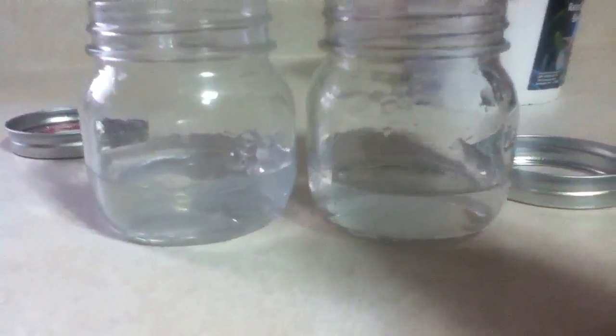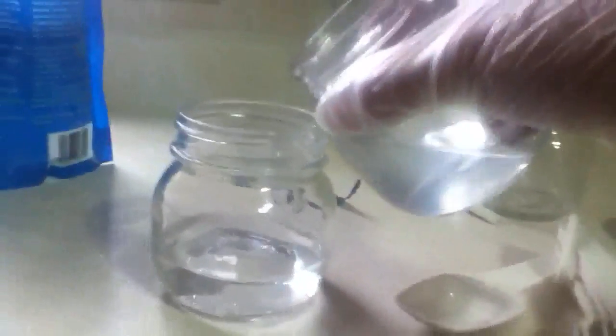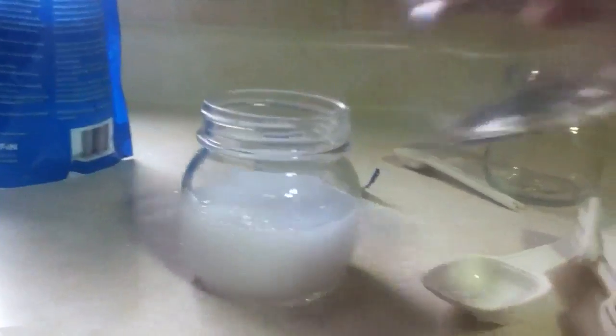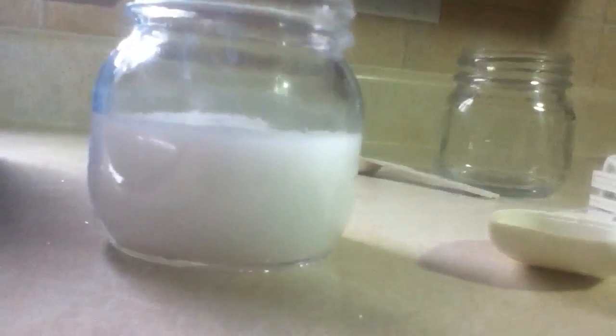One is slightly more cloudy than the other, but that's irrelevant. I'm going to take this magnesium sulfate that's in solution and pour it in. As you can see it's clear, and this one is clear as well. This created a nice precipitate that's kind of slimy — we get magnesium carbonate, and it's kind of oily.